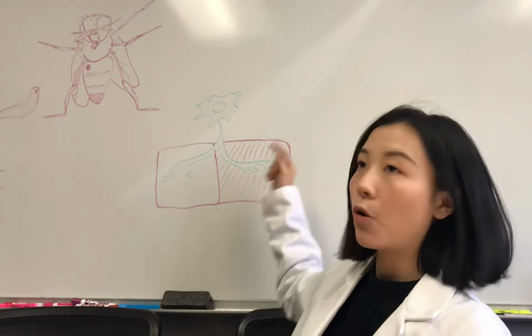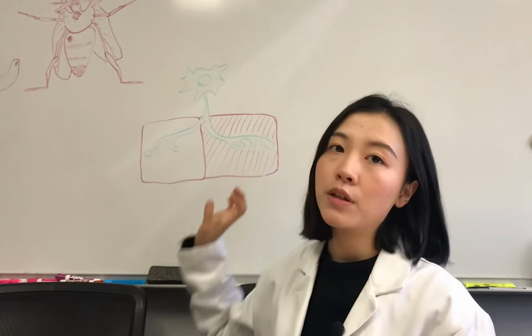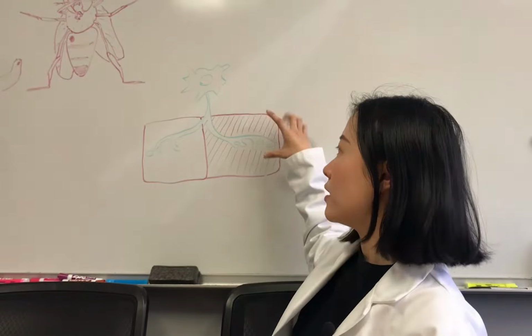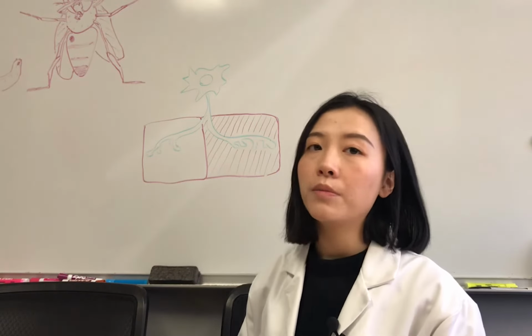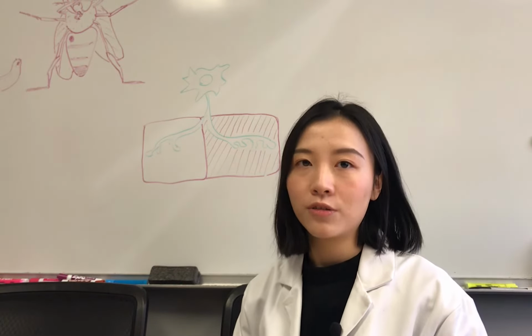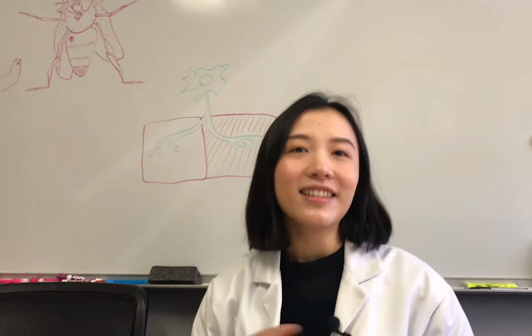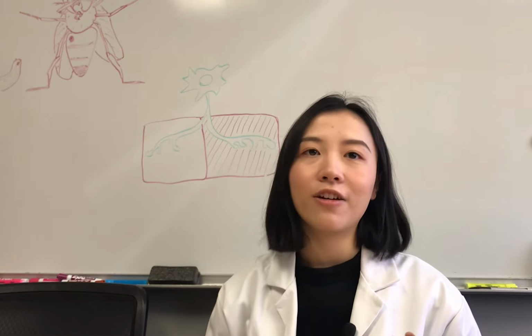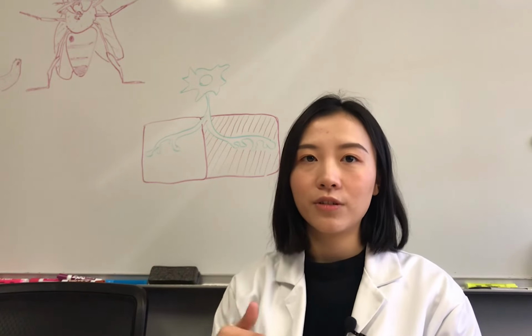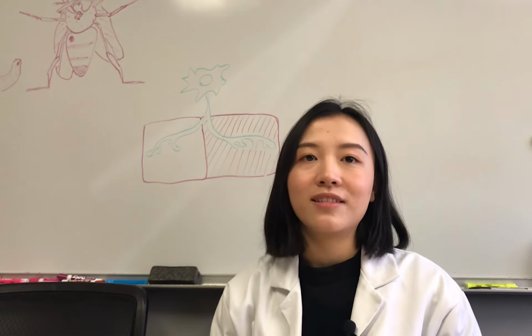I'm performing intracellular electrophysiology to see how neurotransmitter release is modulated. I insert a glass pipette into this muscle fiber to perform intracellular electrophysiology recordings. The glass pipette that I use is from WPI, which I use almost every day. And to fill this glass pipette with the solution, we use a MicroFil. Those are the two most important things that I use every day.